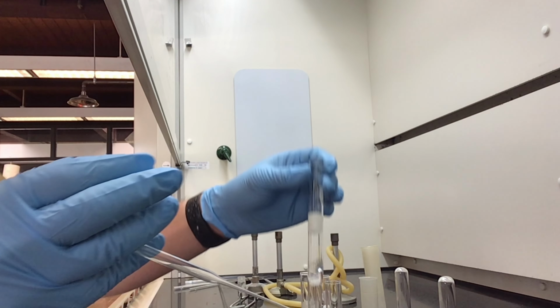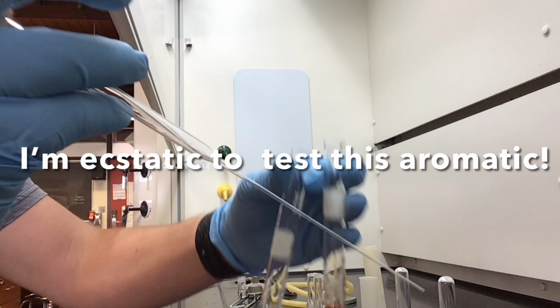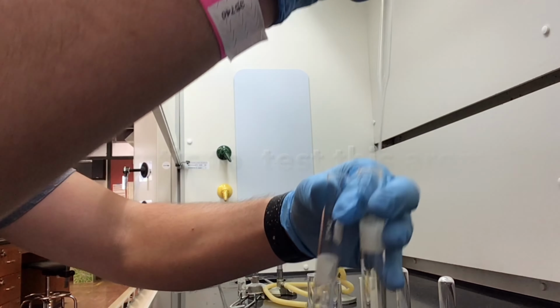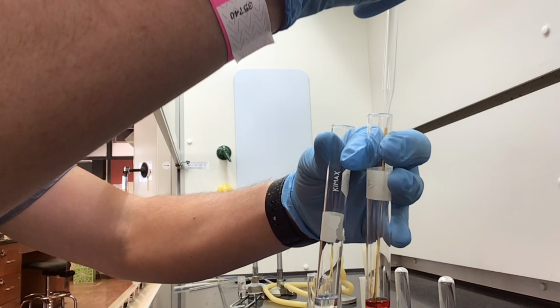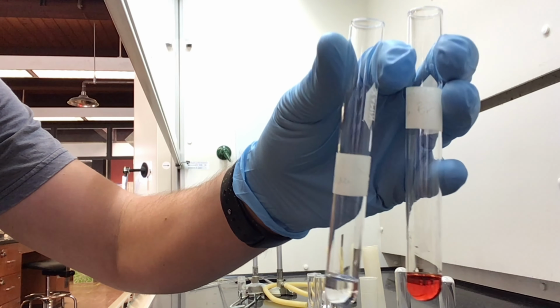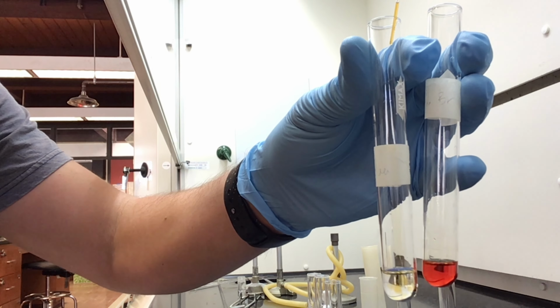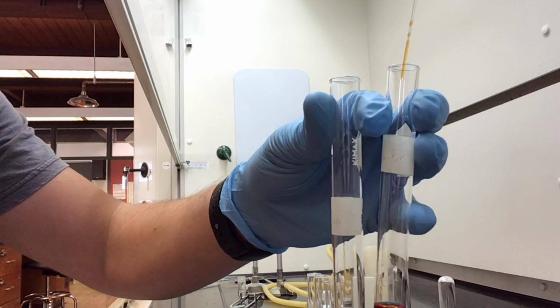So now let's check out another sample. So this is an aromatic compound, okay? So some aromatics will actually react with bromine, okay? With just bromine by itself. Those have to be aromatic compounds with strong electron donating groups.